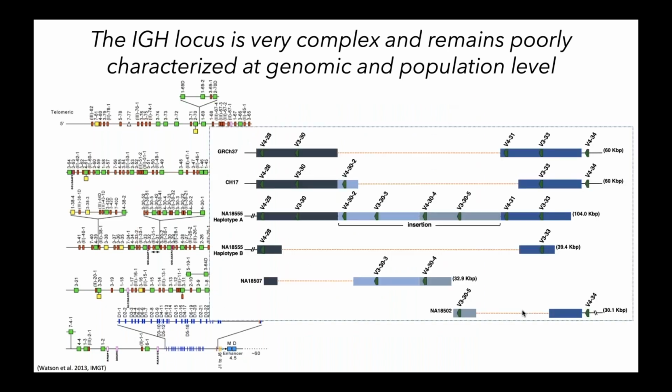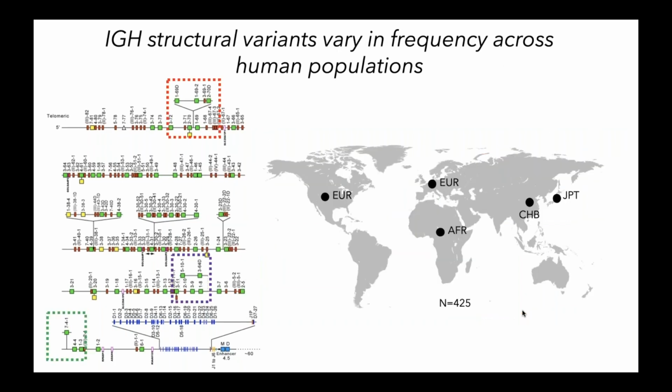And if we break this down, what we actually see is that all of these copy number events are mediated by these 4 complex segmental duplications that sit in tandem. Each of these 25 kb segdups are highly related to each other with respect to sequence identity, at times greater than 90 to 95% identical. So this again is obviously a challenging region to interrogate.